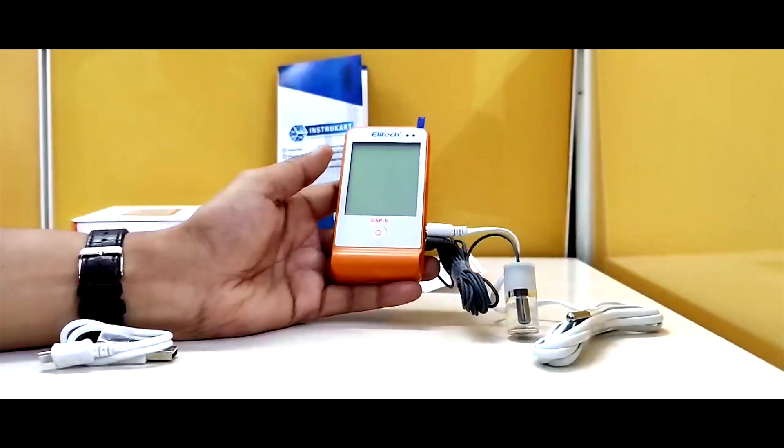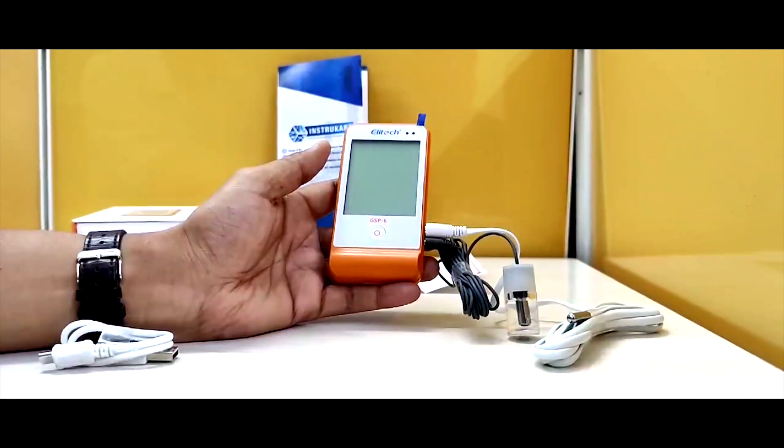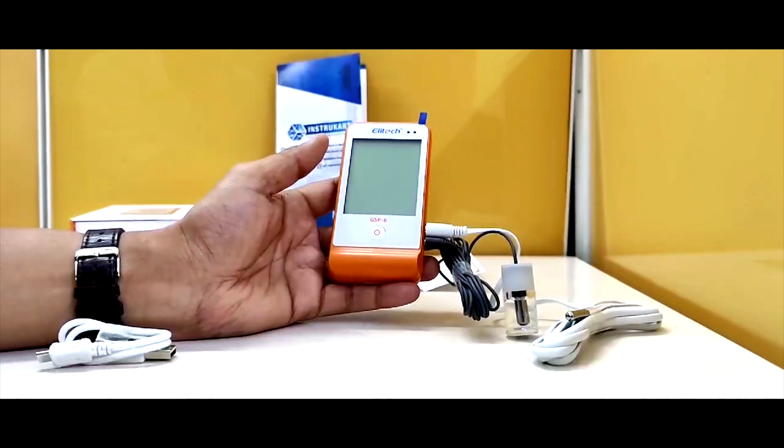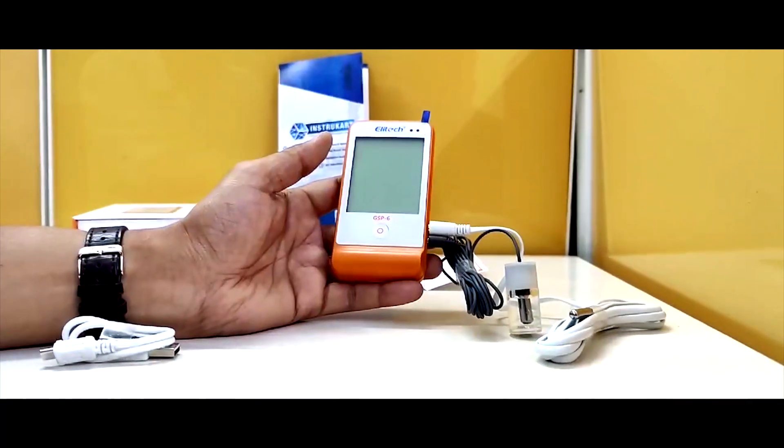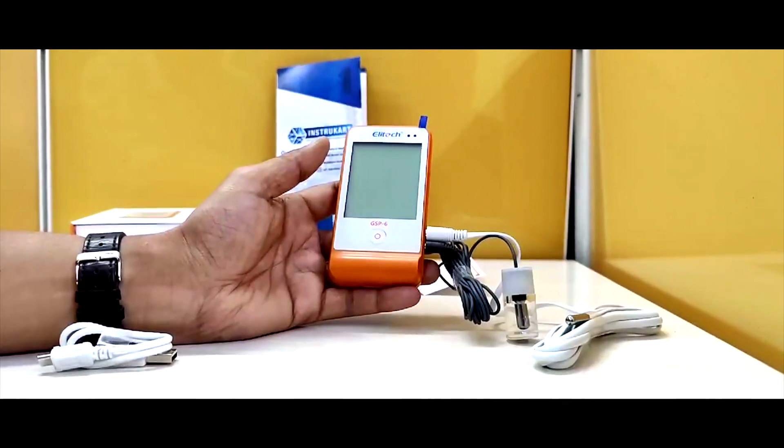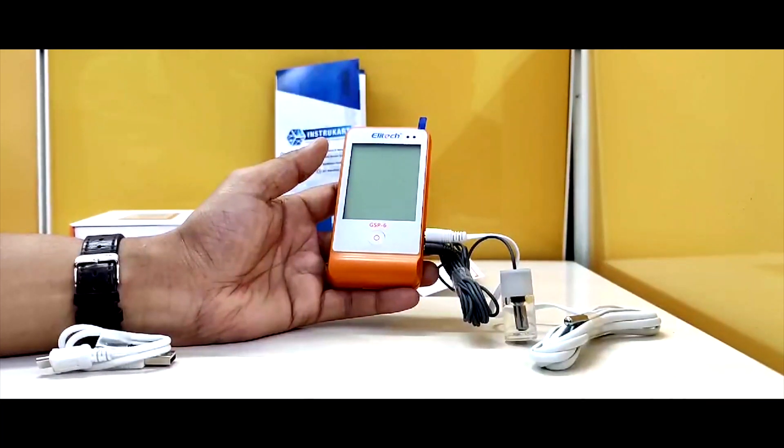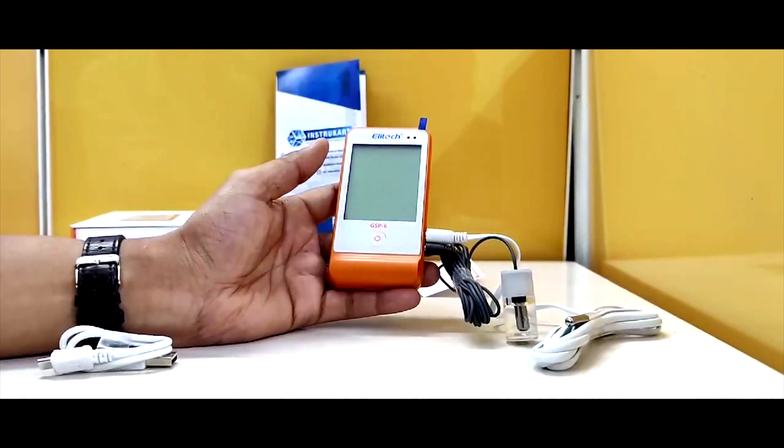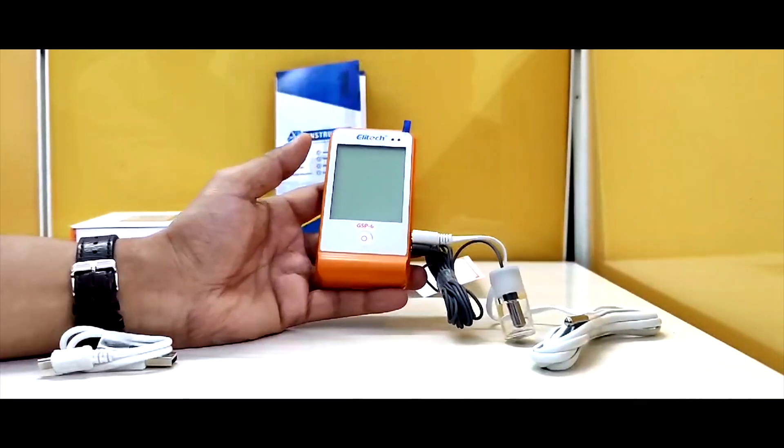With a temperature accuracy of plus or minus 0.5 degrees Celsius, and humidity range from 10 to 99 percent with a humidity accuracy of plus or minus 3 percent RH.